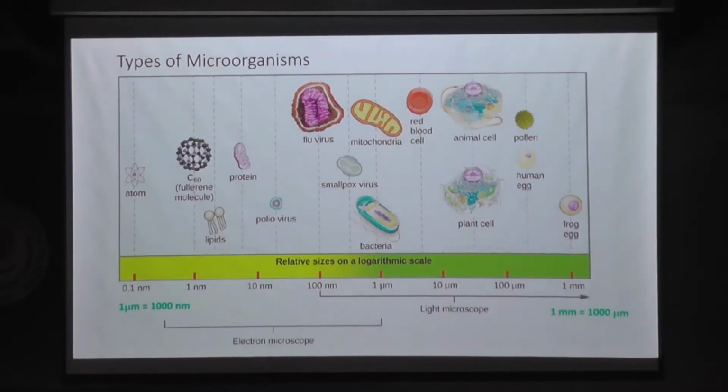When we talk about small things, there are different equipments also to see objects which we cannot see with naked eyes. Microscopy helps us to see anything having a size of 0.1 micron. Even smaller than that can be seen, but those will be electron microscopes and others.